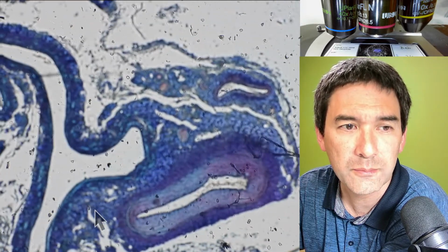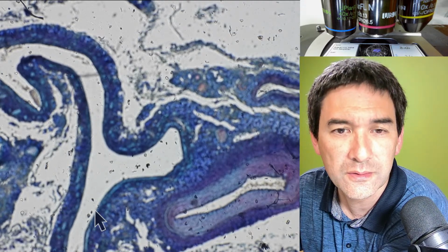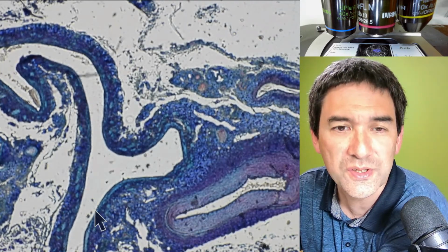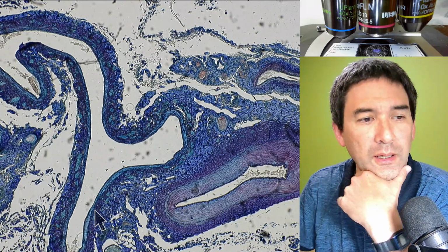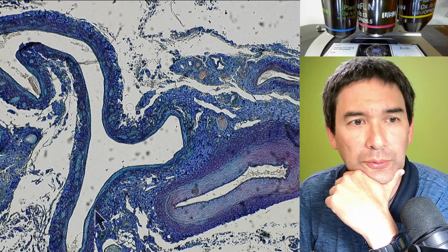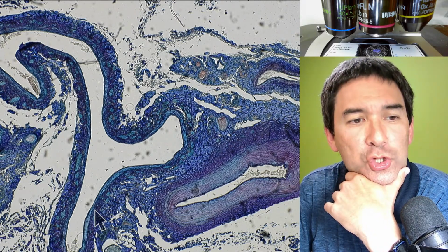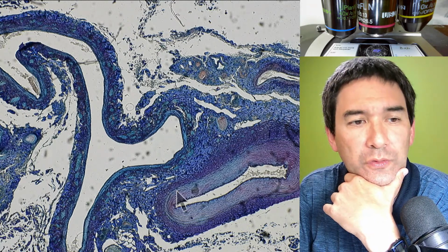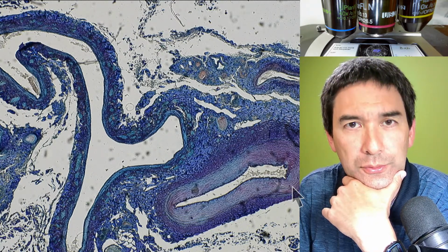Let's just focus this a little bit. I would like to illustrate something here. What you see over here with a 4 times objective, how much you see from here to over here, this is referred to as the field of view.